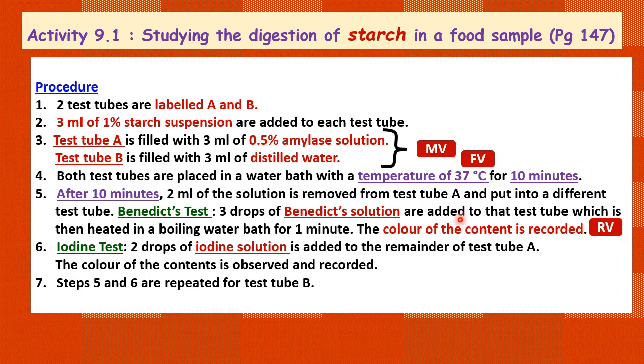So we must heat the mixture of Benedict solution and the sample solution in a boiling water bath for 1 minute in order to see, and then after that only we note the color of the content. Whether there's a brick red precipitate, or whether it remains blue.